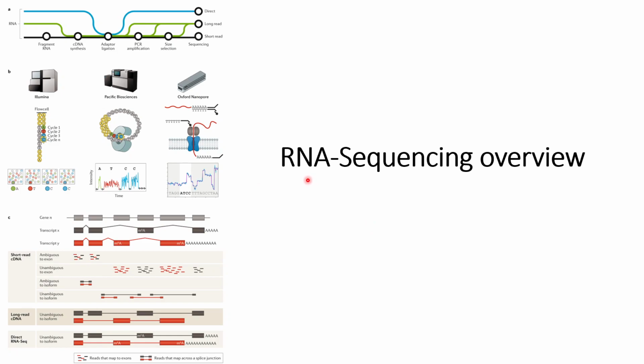In this video we will discuss this RNA sequencing overview. What are the different approaches that are available to sequence RNA, and what are the advantages and disadvantages of them, that we will cover here.